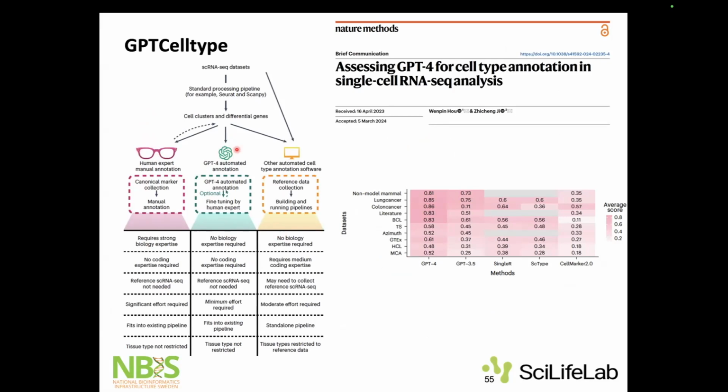For example, for different diseases, these are the markers that I get, which cells are they associated with, and then yeah, it's like a chain of commands, and they called it GPT cell type. And they also showed that it performs better than SingleR and other methods. So instead of an expert reading papers and finding the markers, ChatGPT is doing that for them. So that's also one way of doing that.